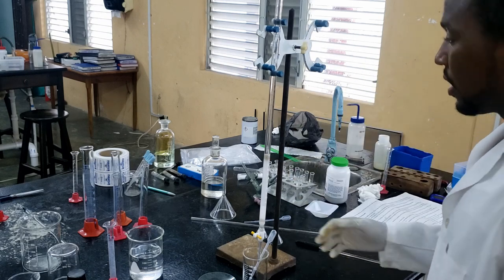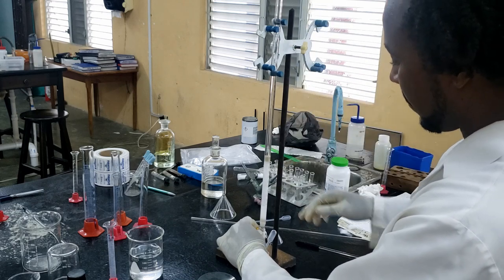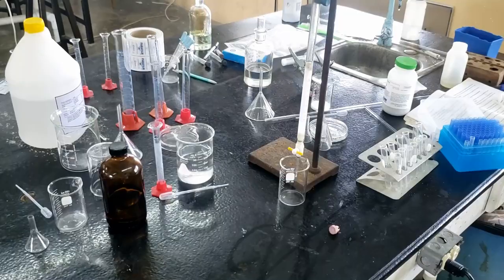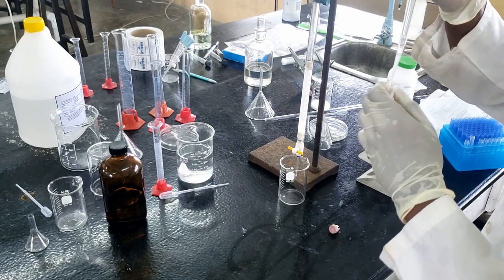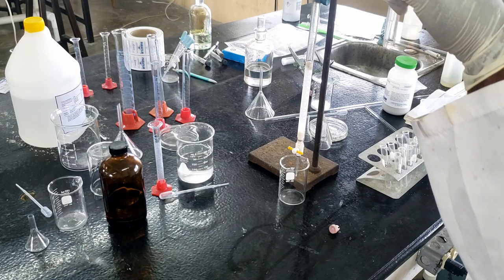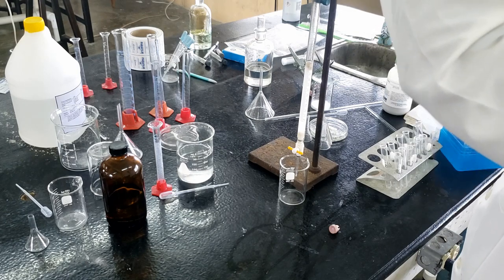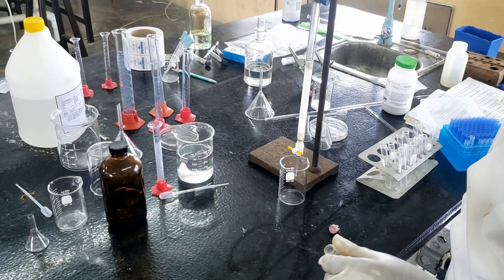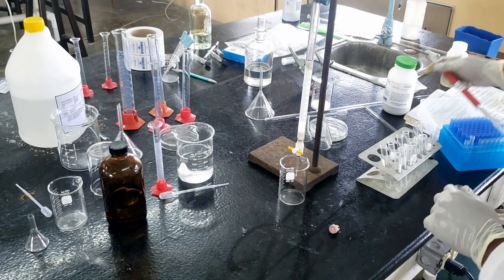So we're going to drain into a beaker, collect that eluent, because we can reuse it. So we just drain until about the level of the sand. So we have a 200 microliter pipette. We're going to take some of this p-bromonitrobenzene up. We have it diluted in some ethyl acetate. And we're just going to add that to the burette. That's good.